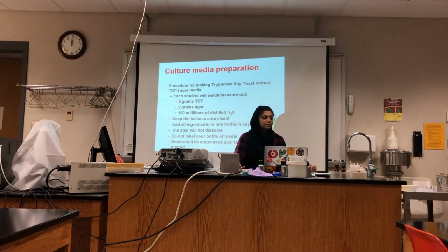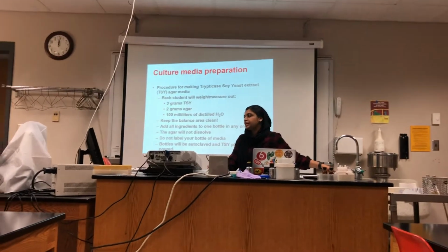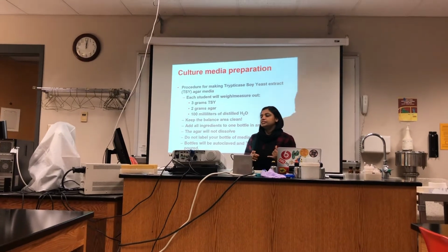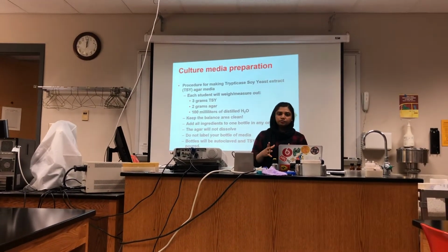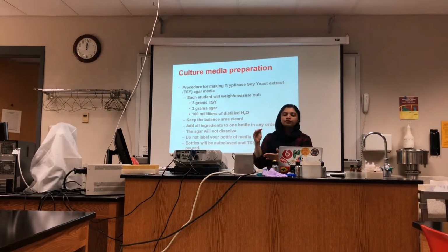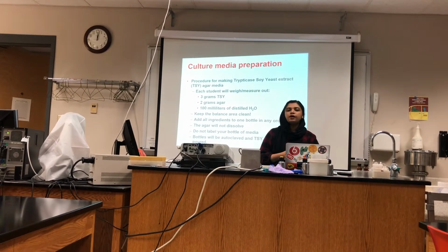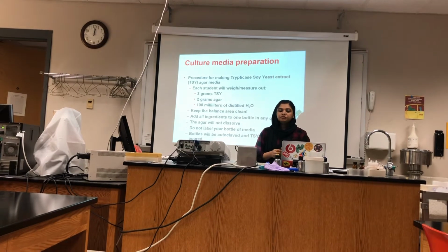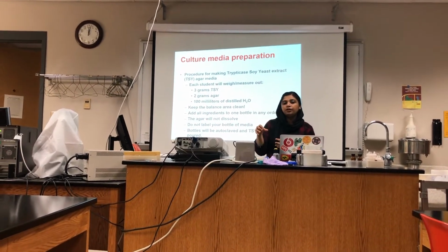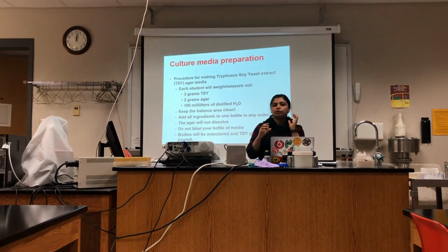For this class, we'll be preparing the TSY, that's trypticase soy yeast extract agar media. For this, we will have TSY, agar, and water. This is what we are going to do. We'll be taking 100 ml of water in a bottle, and then weighing 3 grams of TSY and 2 grams of agar. We want to make sure that the TSY is completely dissolved in the bottle, but the agar will dissolve only after autoclaving. So we just want to autoclave the bottle.